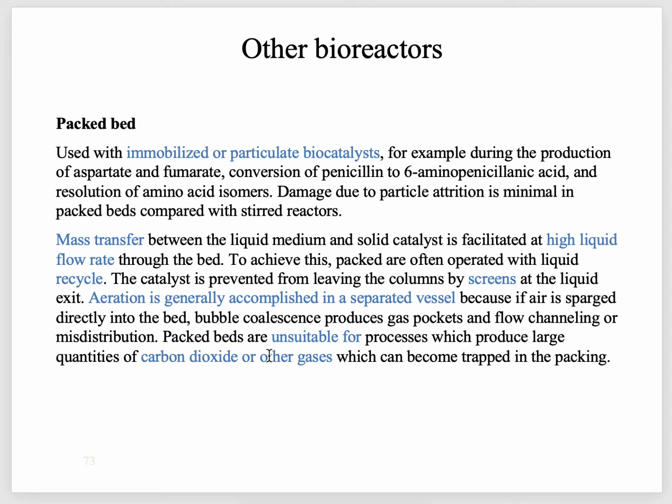Anyway, the packed beds are unsuitable for processes which produce large quantities of carbon dioxide or other gases, which can become trapped in the packing. Basically, if a large amount of carbon dioxide or other gases are produced, they'll also produce gas pockets. So that's why these packed bed bioreactors are not suitable for those processes in which large quantities of carbon dioxide and other gases are produced. Okay, so this was about the packed bed bioreactors.